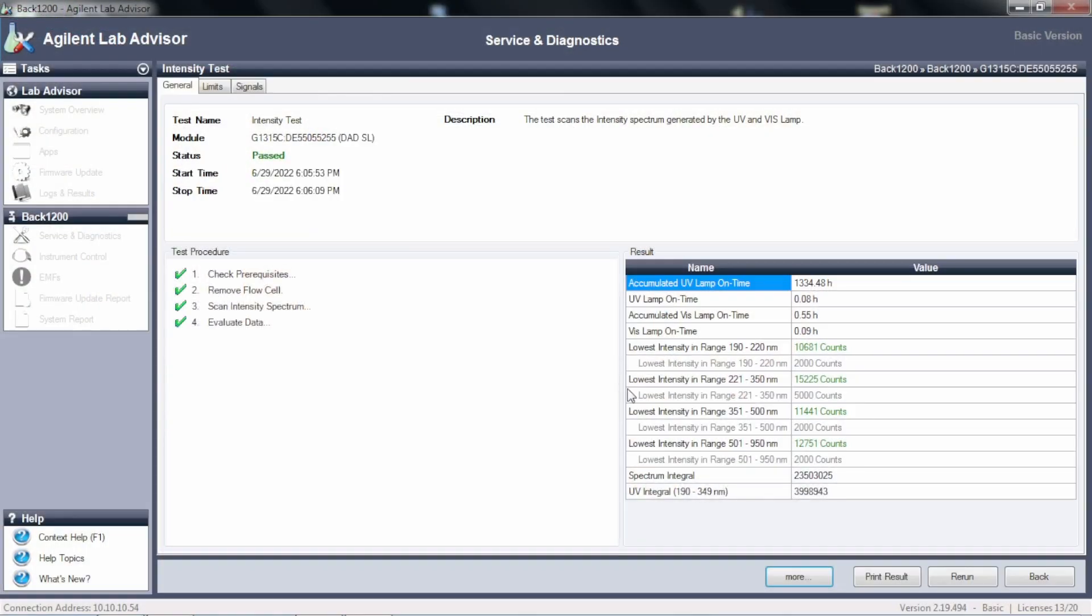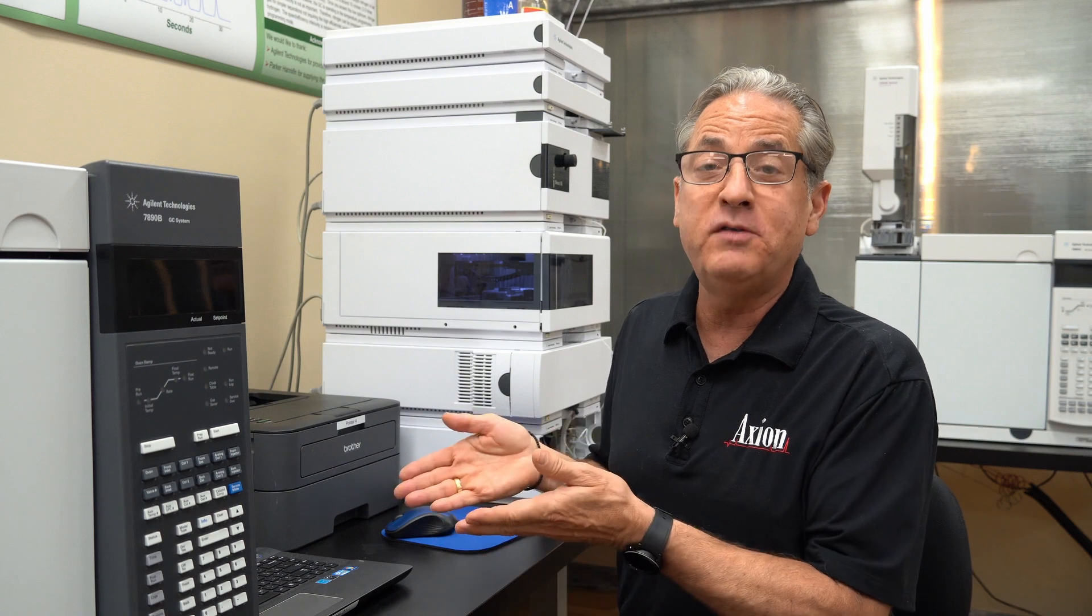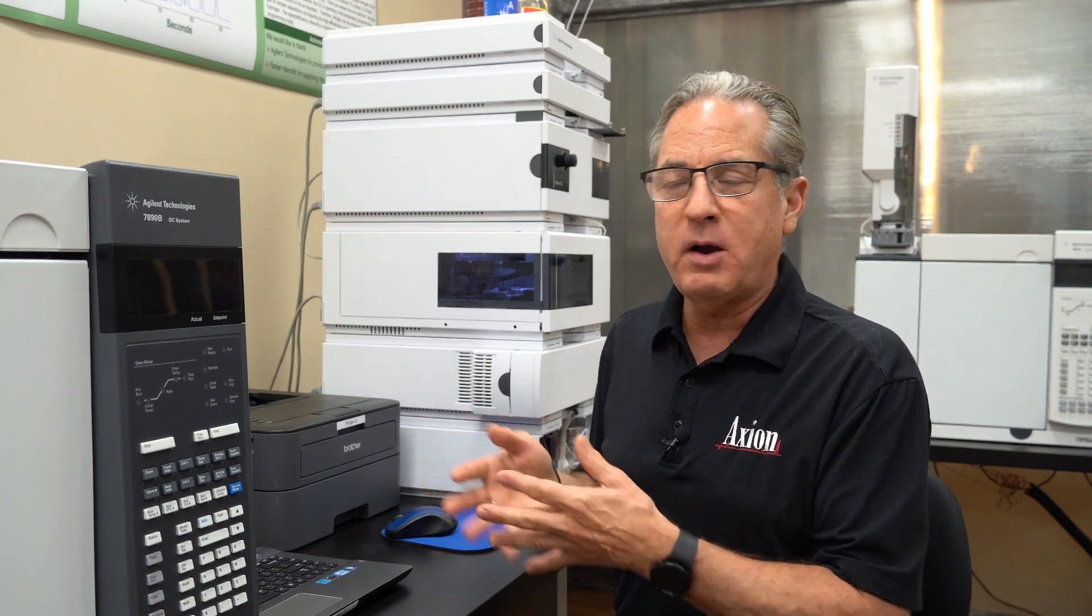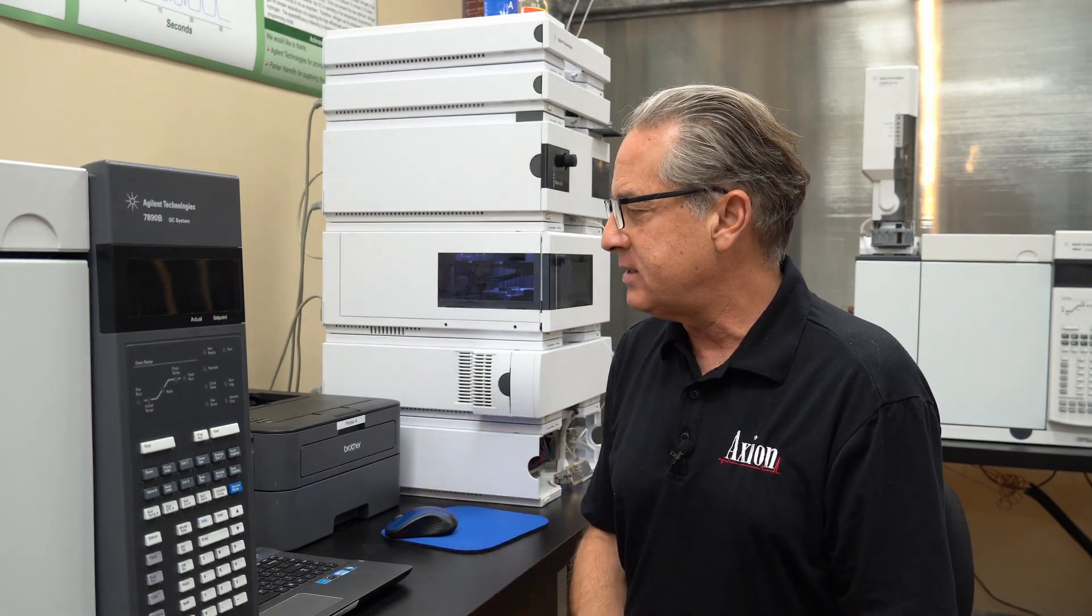So in this case, I could see that in the low UV, the 190 to 220, remember I had less than 100 counts before? Well, now I'm up to 10,681 counts. So I've got plenty of sensitivity, plenty of lamp energy left. That lamp, even though it's past its prime time, it has plenty of energy, plenty of sensitivity left in it. And I proved that just by running the quick lamp intensity test.